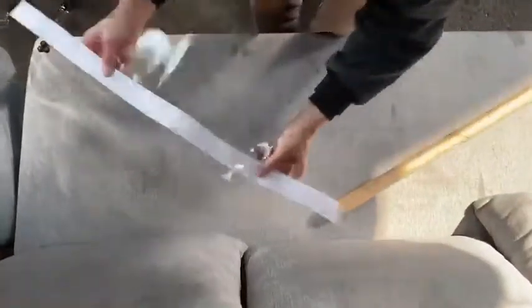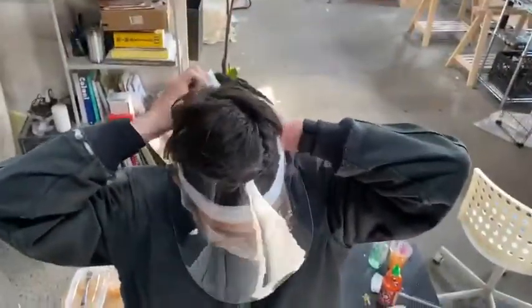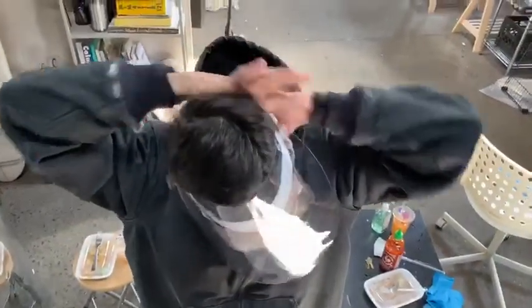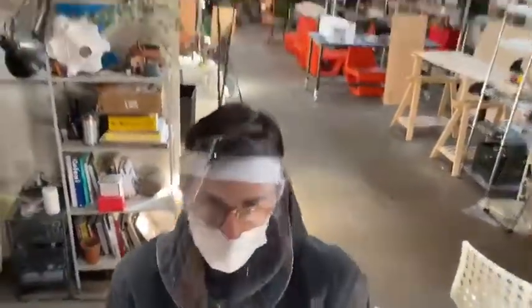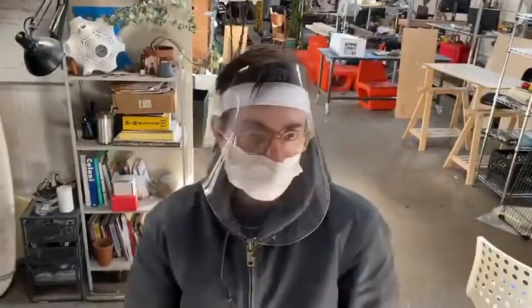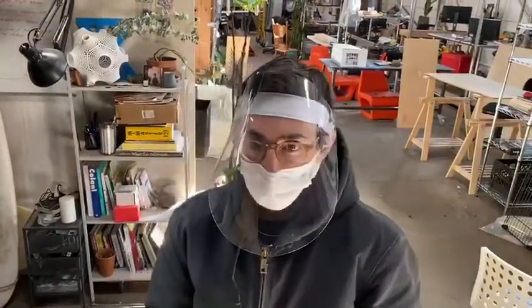The reason for that part is that when you're wearing it and you pull it tight, you want a little bit of room in the face. That just helps it so that when people are putting it on, they make sure that they have the right clearance for their glasses and their mask and everything. That's it.